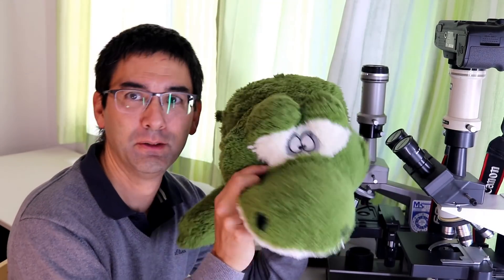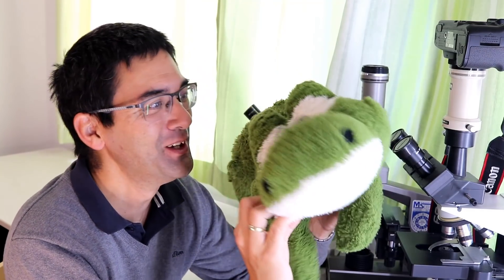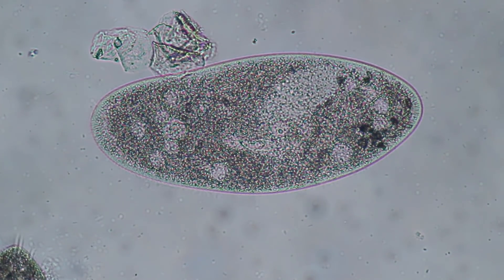Hello, this here looks like a little crocodile. Well, just imagine this is not a crocodile. Just imagine that this is the water organism Paramecium. So this is going to be my model right now.